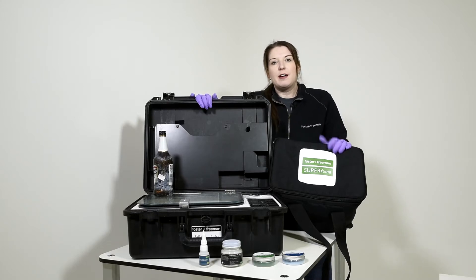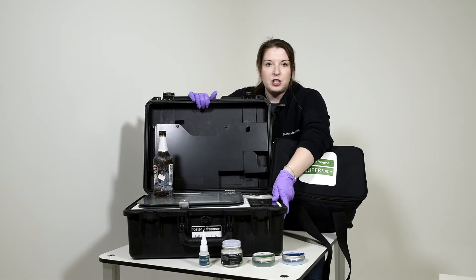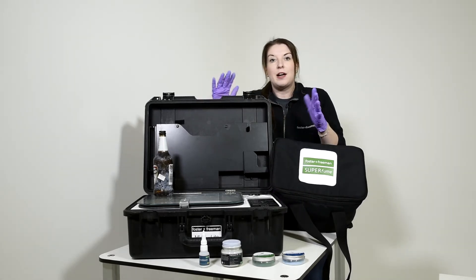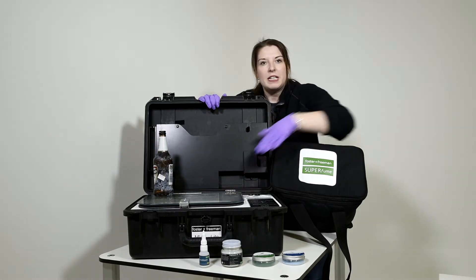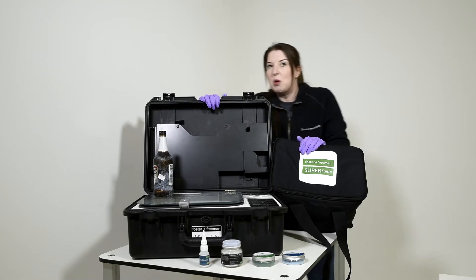First, we're going to start by looking at some of our fingerprint products that you could take in a mobile laboratory to the scene with you. You can see here we have our MVC Light, which is a fully portable cyanoacrylate fuming system. So you can fume very small pieces of evidence whilst you're at the scene, including inside your mobile laboratory.